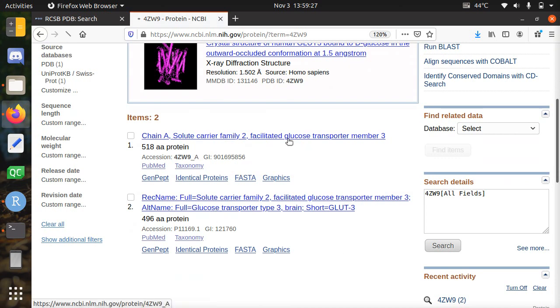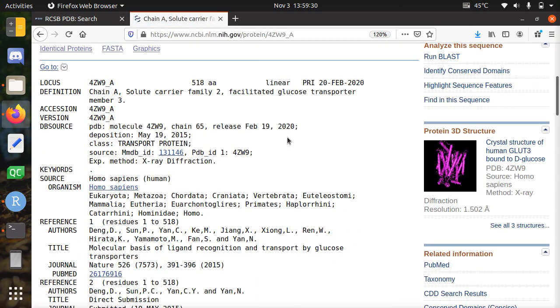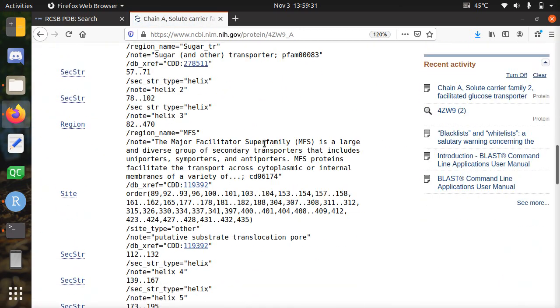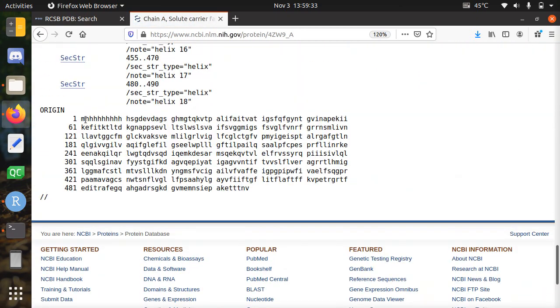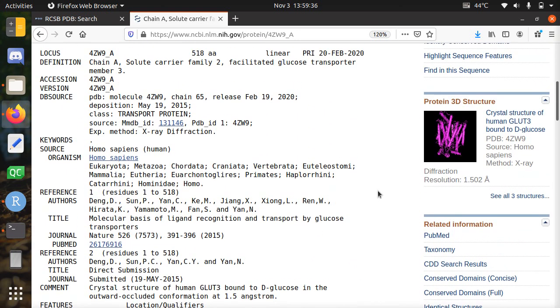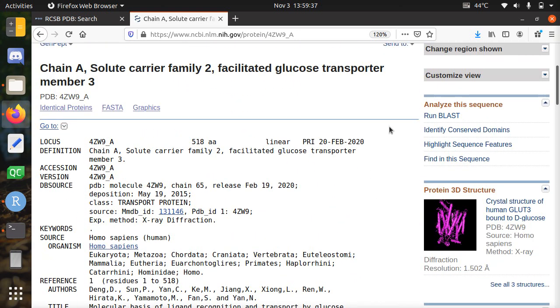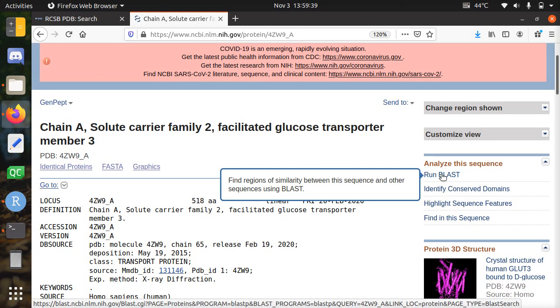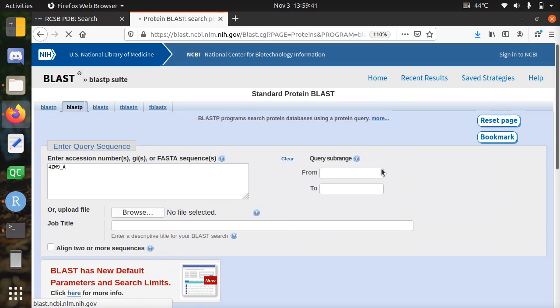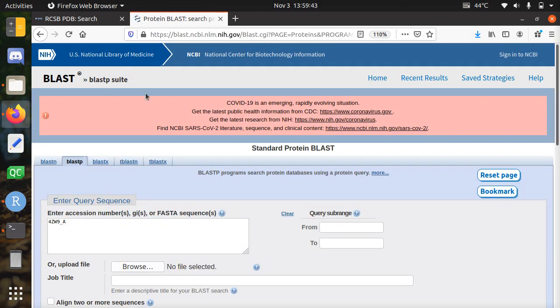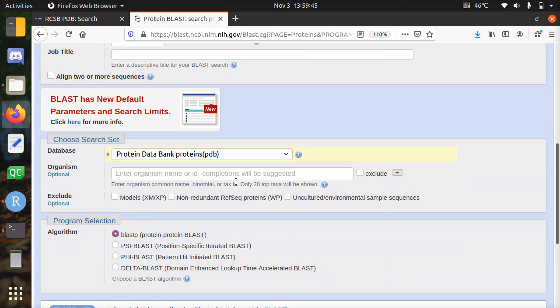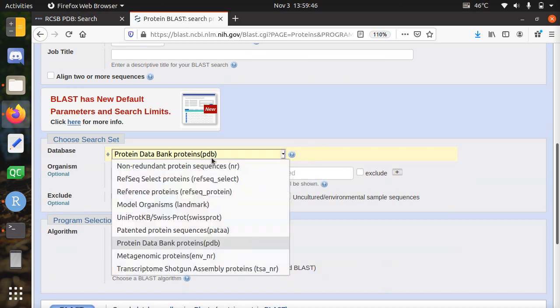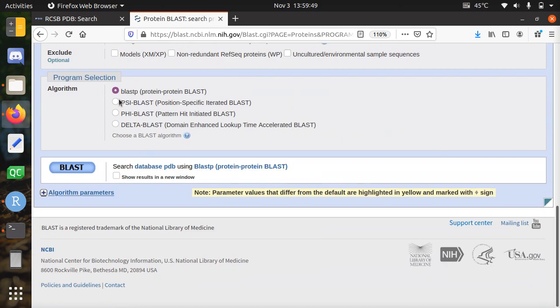Well, I'll take up the first hit. So here I get the sequence of that protein. And what I'll be doing now here as well, I'm going to look for related sequences by running BLAST, but in this case it's BLAST-P because it's for proteins, using all the defaults except that I use the protein databank. I'm going to run BLAST-P and BLAST.